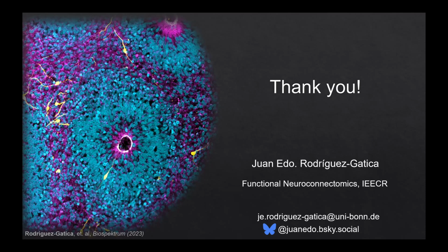Okay. Yes, because I use confocal before, but after I use a light sheet, so it's not the same technique. And do you have some possibility to measure the distortion of your sample or not? Yes. Well, depending on the structure, we can use different methods. For example, when you work with mouse brain, it's quite easy to find a region, let's say the dentate gyrus, where most of the nuclei are about 10 microns, and it's really precise.